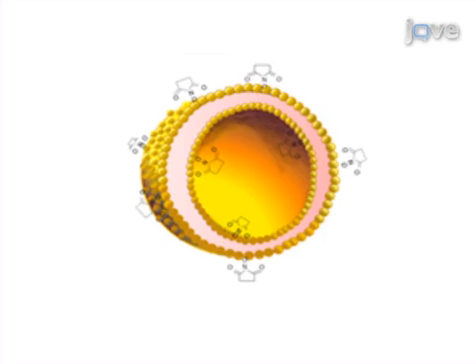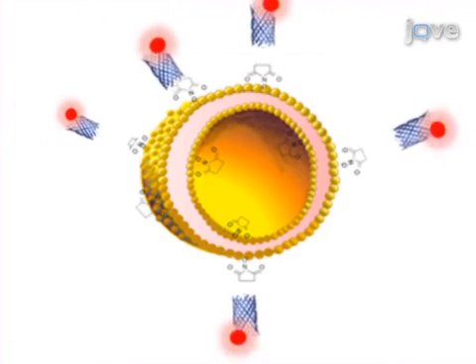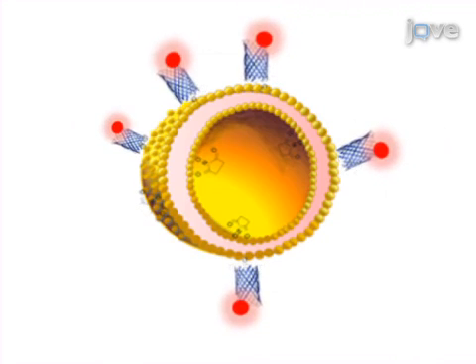First, polymer diacetylene, or PDA, is synthesized, and PDA liposomes are prepared. Next, rhodamine-tagged BSA is bound to the PDA liposome surface.